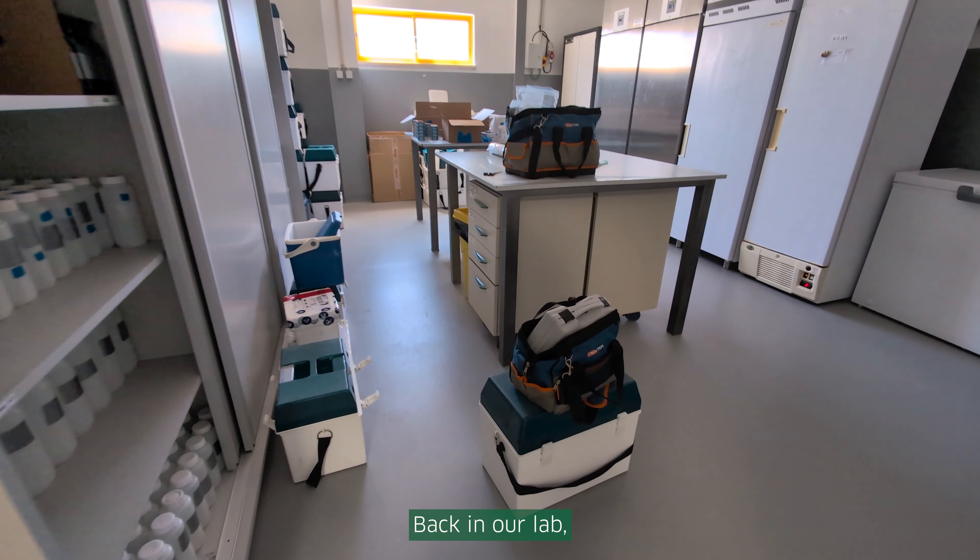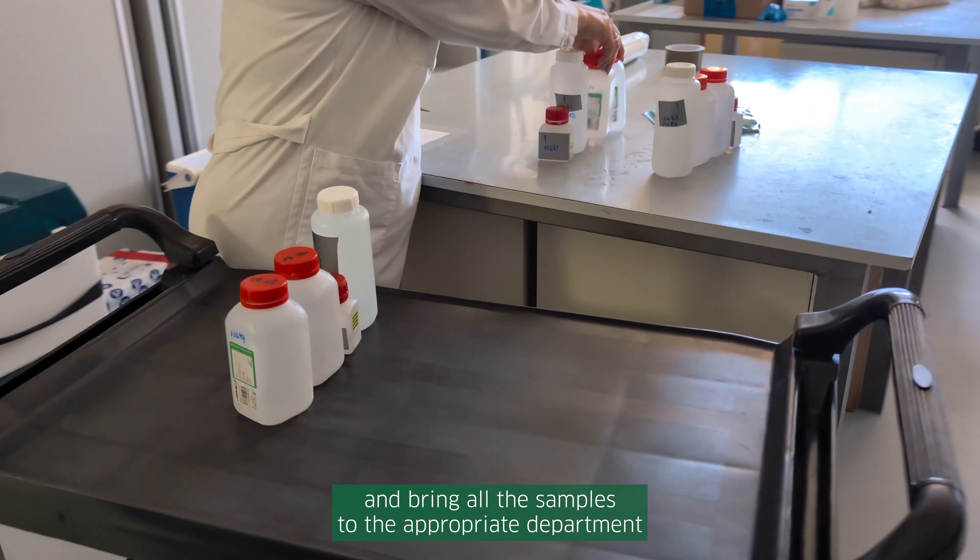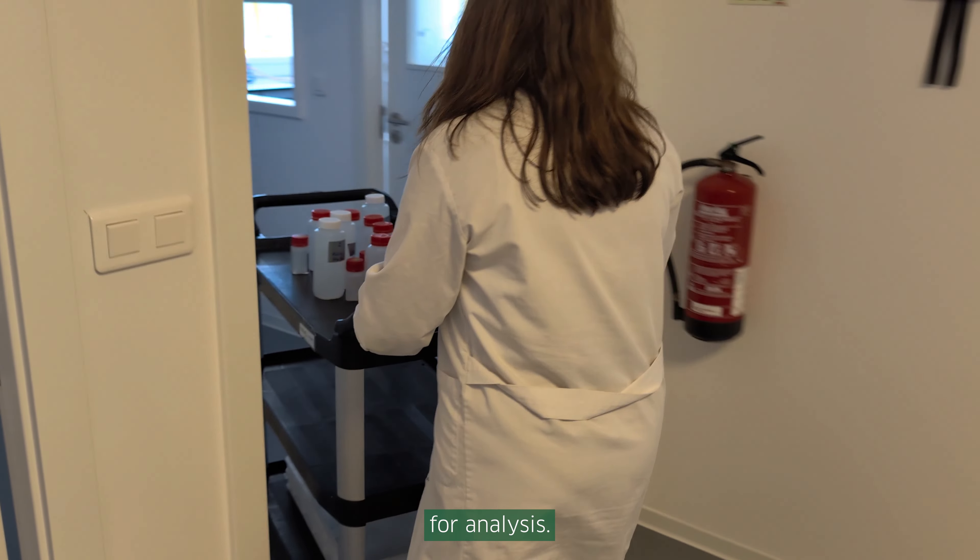Back in our lab, we register everything in the system and bring all the samples to the appropriate department for analysis.